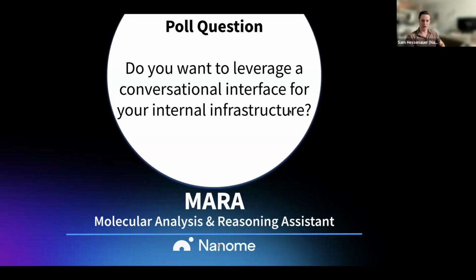Adding on to that, we're not an algorithms developer, right? We're a tool orchestrator and aggregator. We're not developing novel methods for synthetic routes, but we can really easily integrate other people's providers. So think of us as: Mara is as powerful as the tools it has, but it's extremely extensible and easy to add things on there and build up your repertoire of tools for use and workflows. When we get questions like, can it do this, can it do that, I say it can do almost anything. The question is, does it have the tools yet? Keep that in mind.